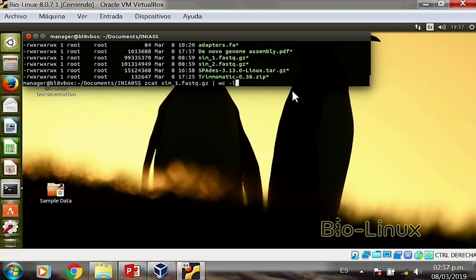If you aim for around 300 base pairs as an insert size, then you probably have plus or minus 100 base pairs, so you have between 200 and 400 base pair insert sizes. And there's going to be pretty much a normal distribution of the sizes, of the distances between each of these pairs. But that's something we cannot see from here. We can only see the sequences. To actually look at that, we will need to either assemble it or map it to a reference genome.